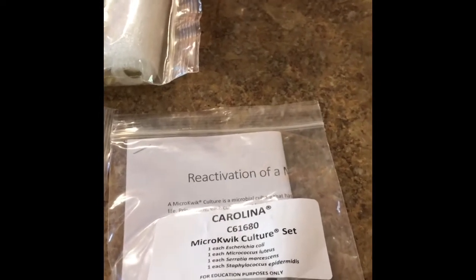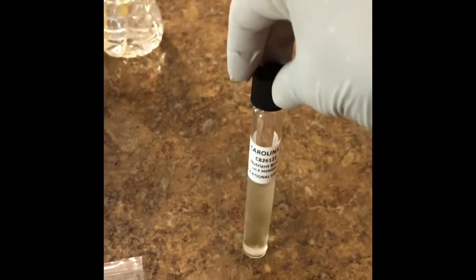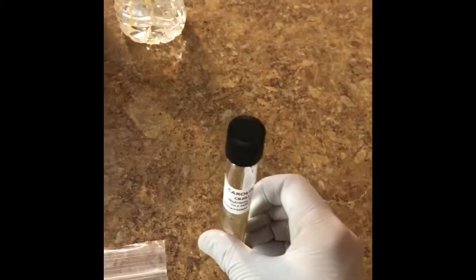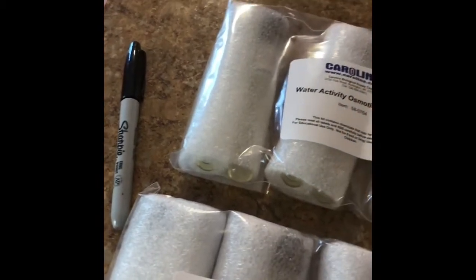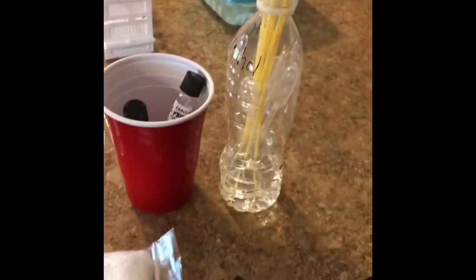And this time, for whatever reason, we're not rehydrating the cultures with tryptic soy broth, which is a little bit darker, but rather one of the bajillion tubes of nutrient broth that they provided. So these were just pulled out of the refrigerator. You can see they have condensation. I'm going to give them a wipe, and then I'm going to use my Sharpie, or you can use the wax pencil to write either E. coli or S. epidermidis or even just S. epi on these, and put them in your rack over there so that you're ready to go. Okay, whoops. And I will see you in just a second.